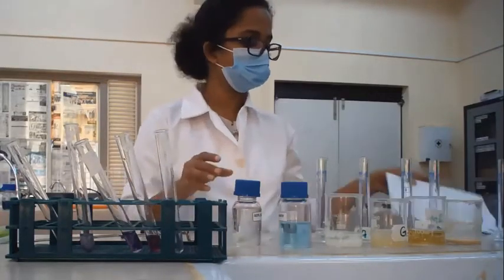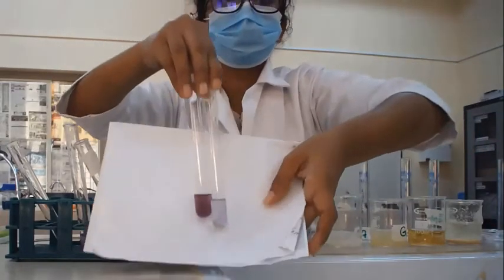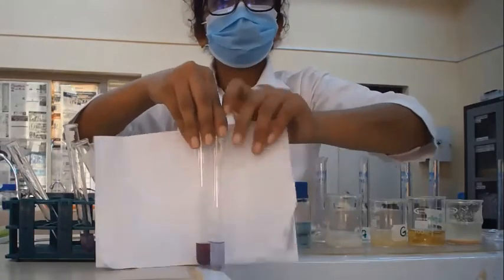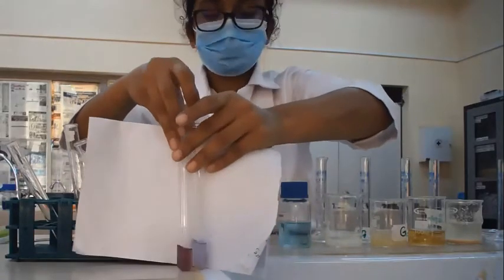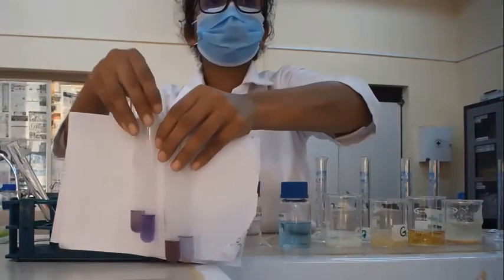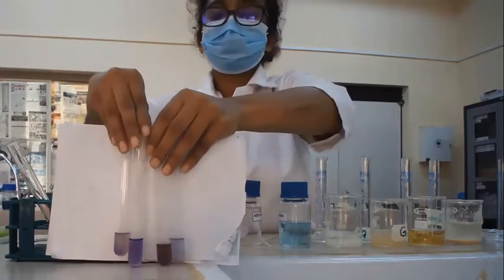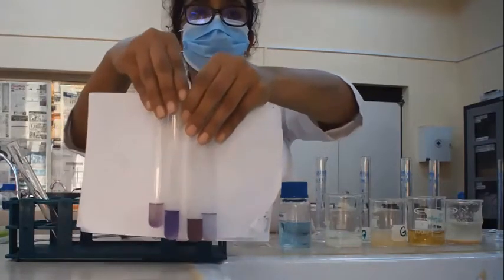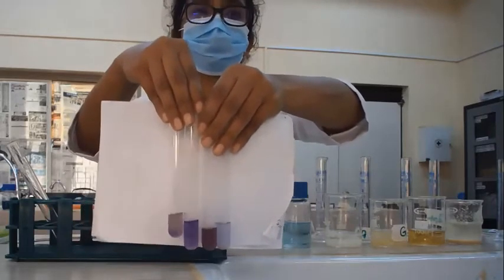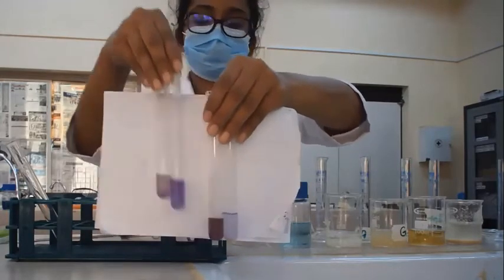Now, you may be able to see how the color changes when we add sodium hydroxide into this test sample. You will see all the proteins reacted to this Biuret test. But there is a limitation of this test. We will see what it is.